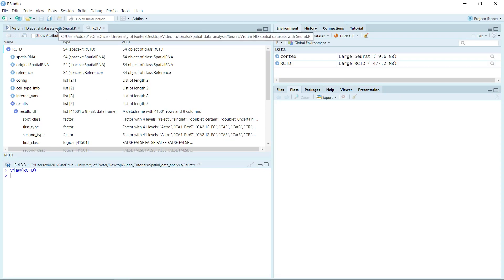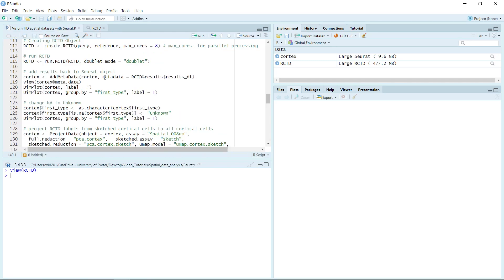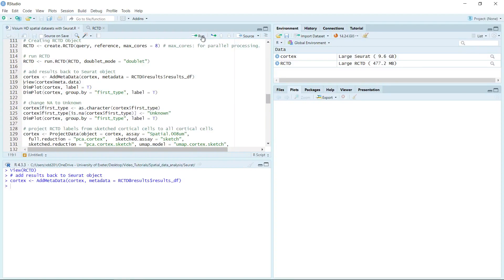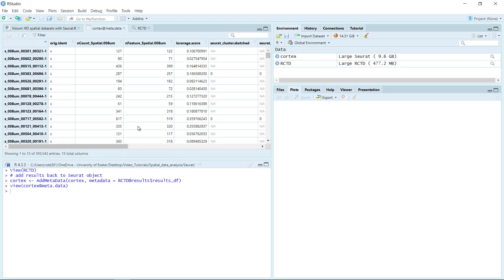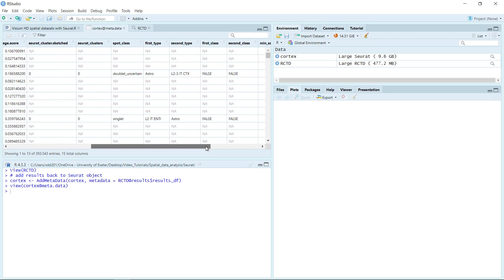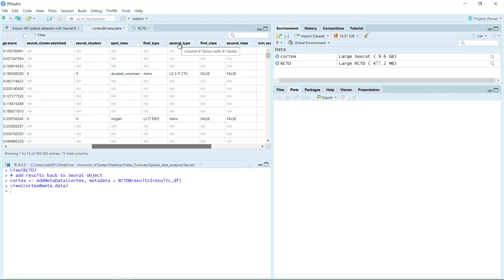Now we can add the result data frame into the cortex object using the addMetadata function from Seurat. We added the metadata. We can have a look at the metadata. You can see now in the metadata we have the first cell type and second cell type. You can see for the sketched dataset, this cell in cluster 0 is astrocyte.